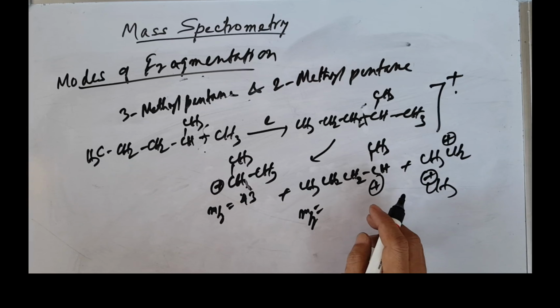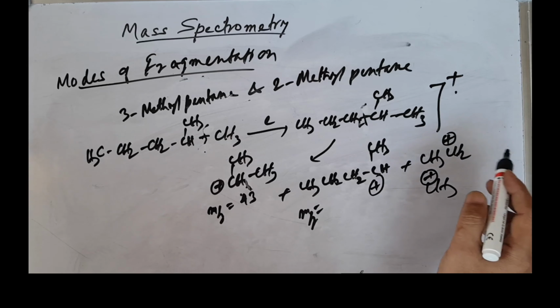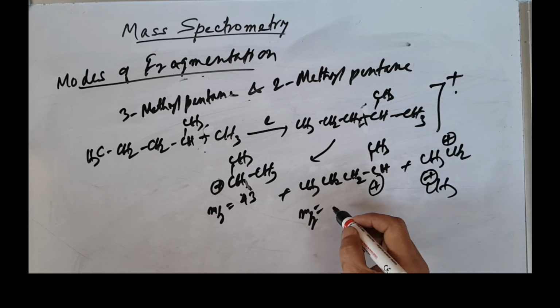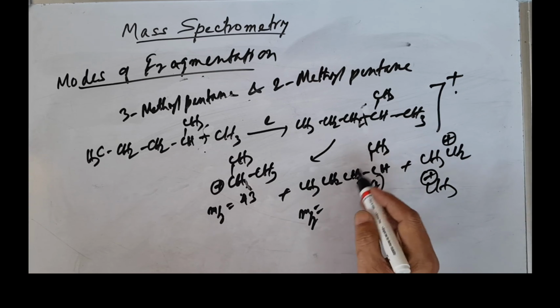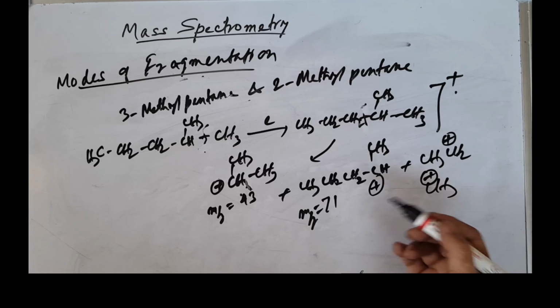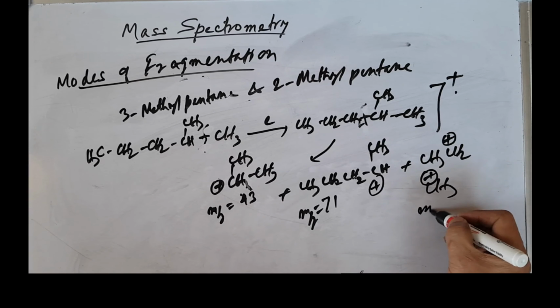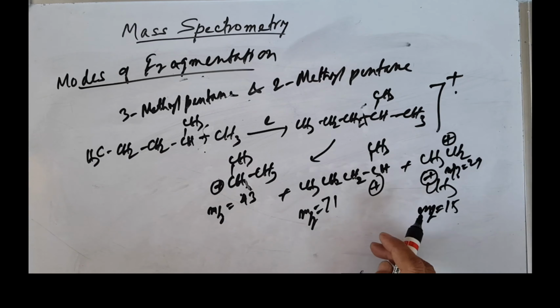Here like this, many permutations can take place. C2H5, then you can have C2H5. So here m/z 71, 1, 2, 3, 4, 5, okay, 60, 1, 2, 4, 5, 71, like this, and this. So many you can have. This is 15, m/z 15, and m/z 29, like the other cases. So you can get so many fragmentations like this.